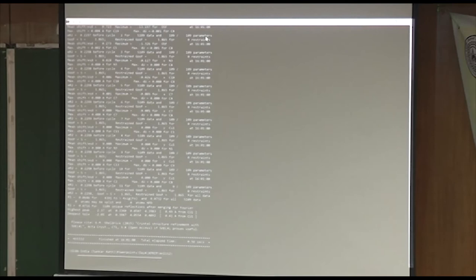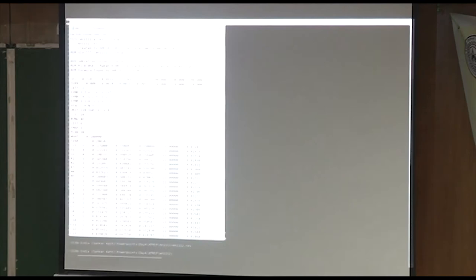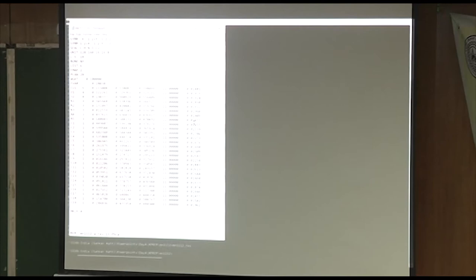Now I want to look at what it did. You see FVAR has changed, it's 0.28 now. These have all been modified, the thermal parameters are here. They look pretty good. There's no outlier. They're all kind of in the same ballpark. I think those are probably identified correctly, those atoms. The next step would be to go on and add hydrogens. Make the non-hydrogen atoms anisotropic. Check it one more time for reasonable bond distances and angles.